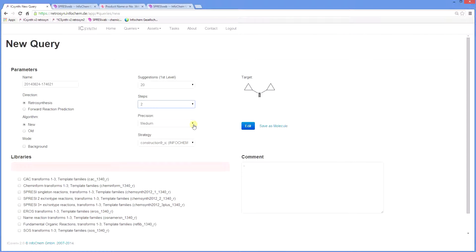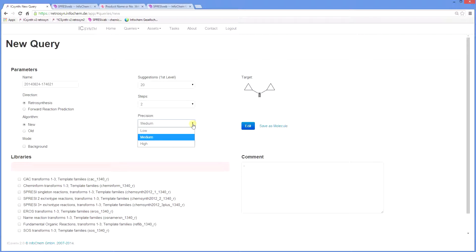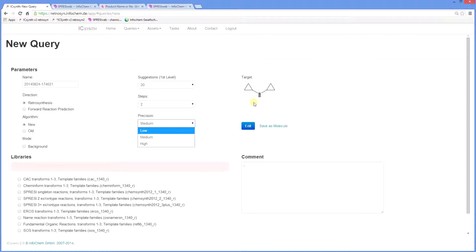The default precision is set at medium, but it can range from high to low. This controls the size of the structure template in the knowledge base that matches the target molecule. High precision gives only very closely matched templates to your target, so fewer answers may be obtained.